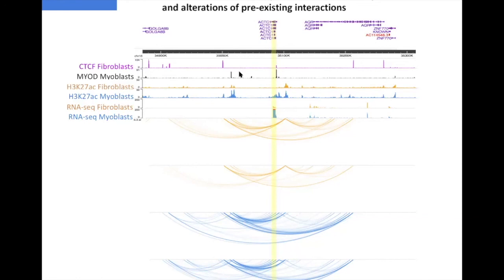It is also possible that other than a typical MyoD promoter binding, this could also be MyoD binding to a promoter that is also part of a potential boundary, which is a CTCF-bound anchor of this loop. So this could simultaneously change the interaction strength of these boundaries and generate these loops. We still don't know how all these loops are generated, but clearly they refer to initial binding of MyoD to this element, this promoter, and perhaps the simultaneous binding to other regulatory elements.